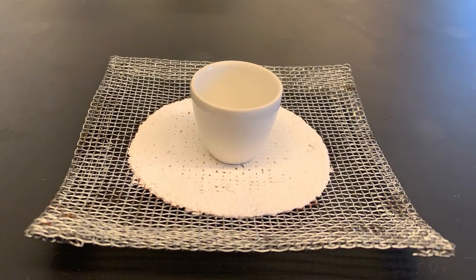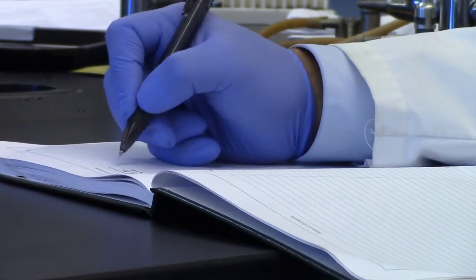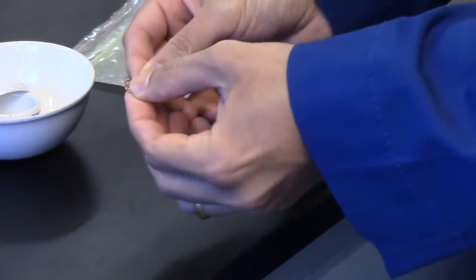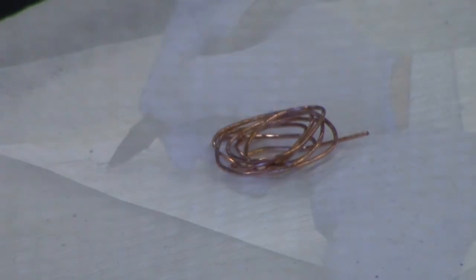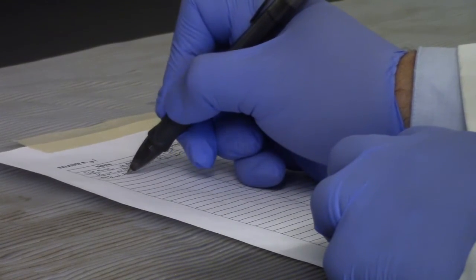While the crucible is cooling, write your description of the copper wire and the sulfur powder that will react. Next, make a flat coil of copper, demonstrating the malleability of the wire, that will fit in the bottom of the crucible. In the balance room, remember to fill out the log sheet.